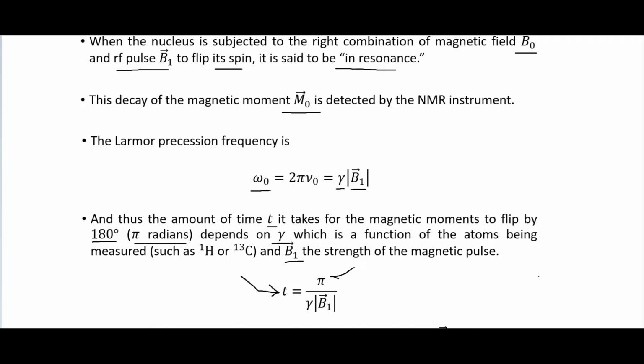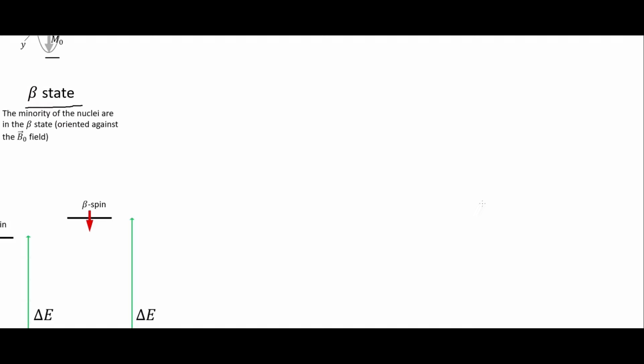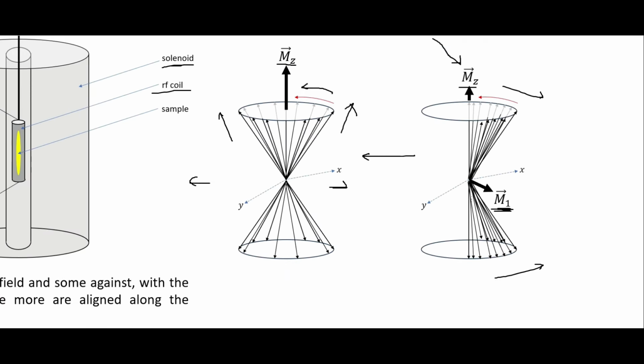So I'm cutting in here because as I was editing this, I think I wasn't very clear on what I was talking about in the section about to come up in the video. So I was talking about this Larmor precession here, and now I'm using this B sub 1. And so what that means is I'm talking about the Larmor precession. Earlier I was talking about the Larmor precession that was around the B sub naught in the static magnetic field, where this is rotating around in this direction. So what happens is when we use that B sub 1, we generate a magnetic field in this direction. And so that means we get another Larmor precession that is going to spin around that magnetic field. And so we are now spinning around in that direction, around the B1 field.